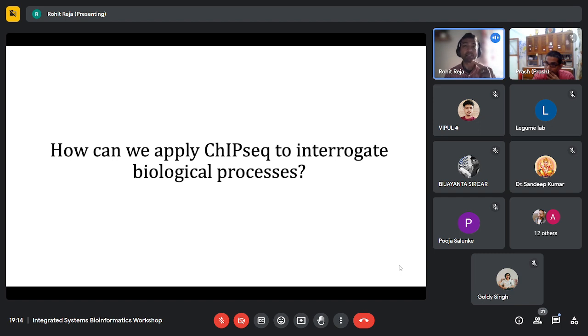But if the peak is present both in the IRF1 knockout and in the IRF1 ChIP-seq, you can say it is coming from the antibody recognizing some other IRFs. That's how you can get around it. But it's a real problem if you cannot generate those knockouts. It's very hard to raise an antibody that is very specific, because you have to make sure the ChIP-seq antibody is good enough that it only recognizes a particular IRF and not the others.